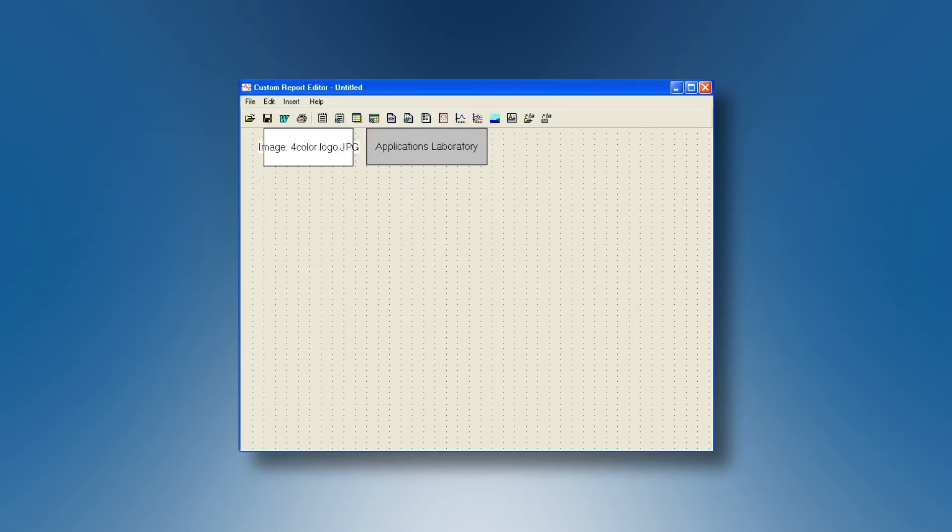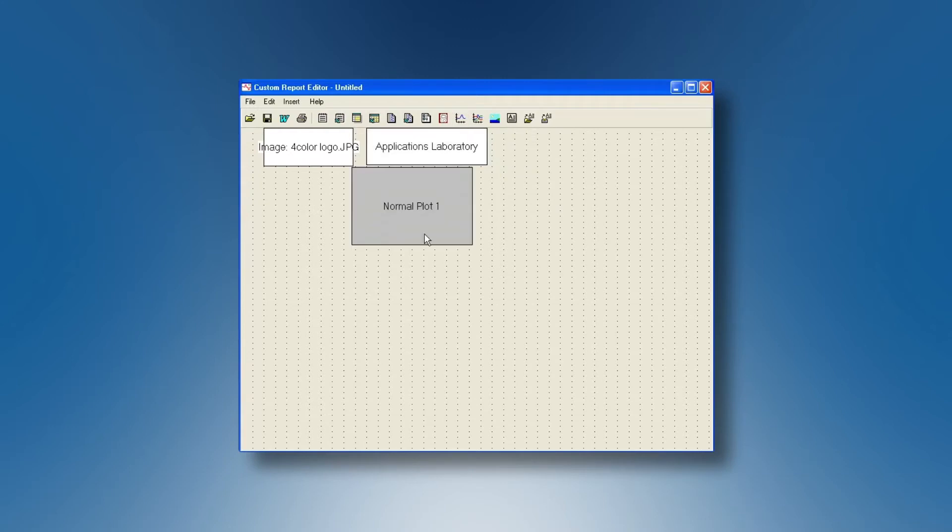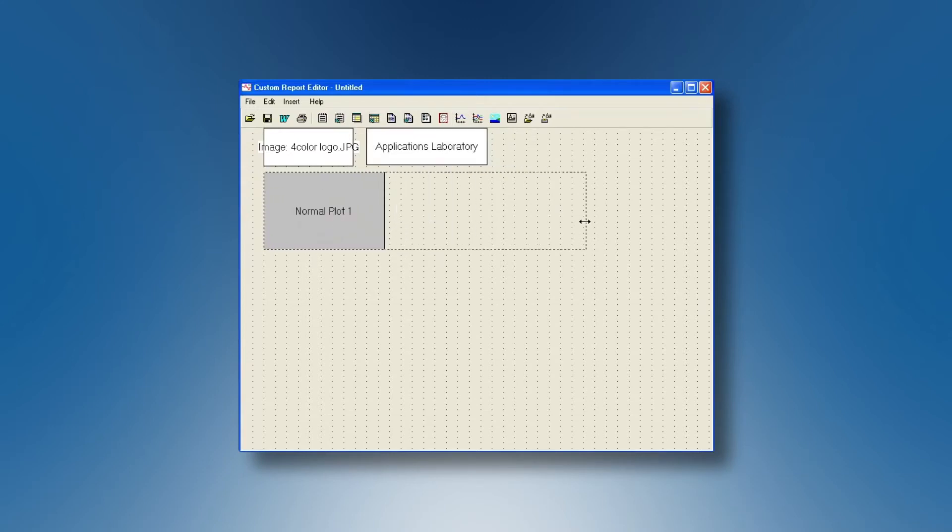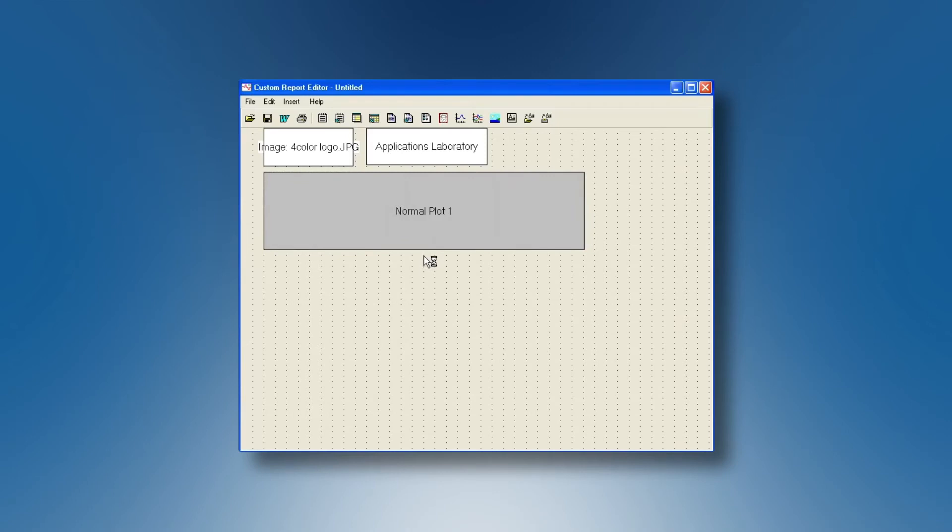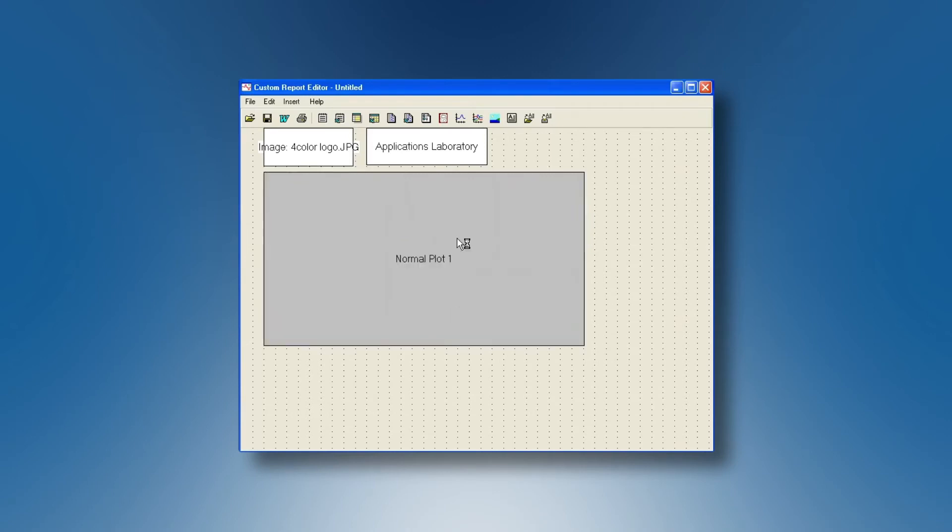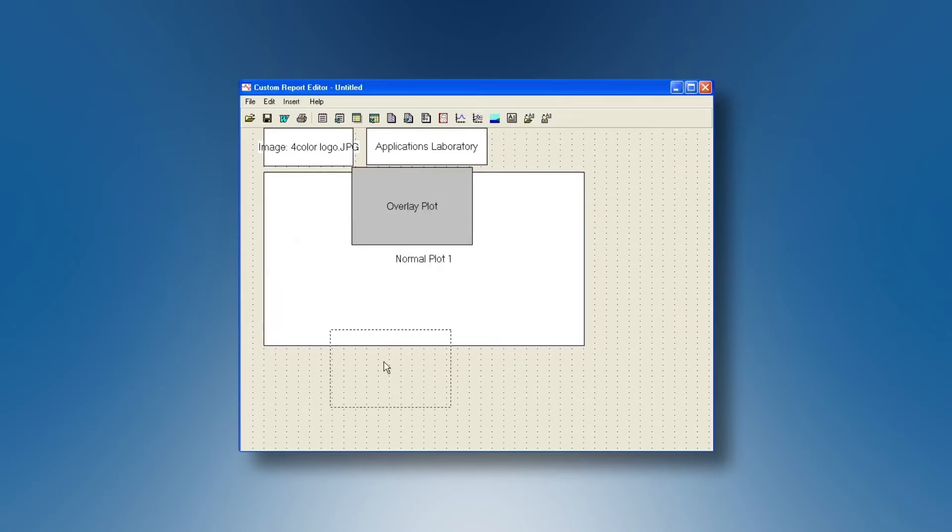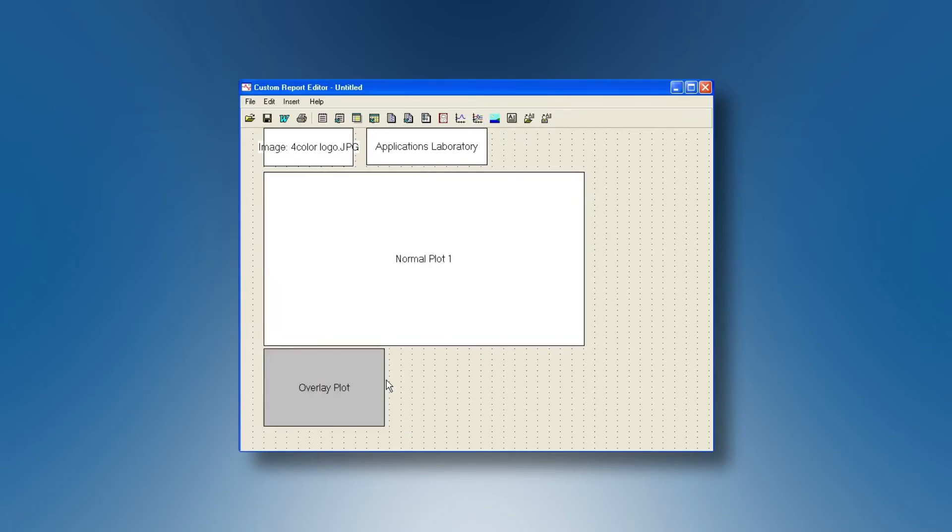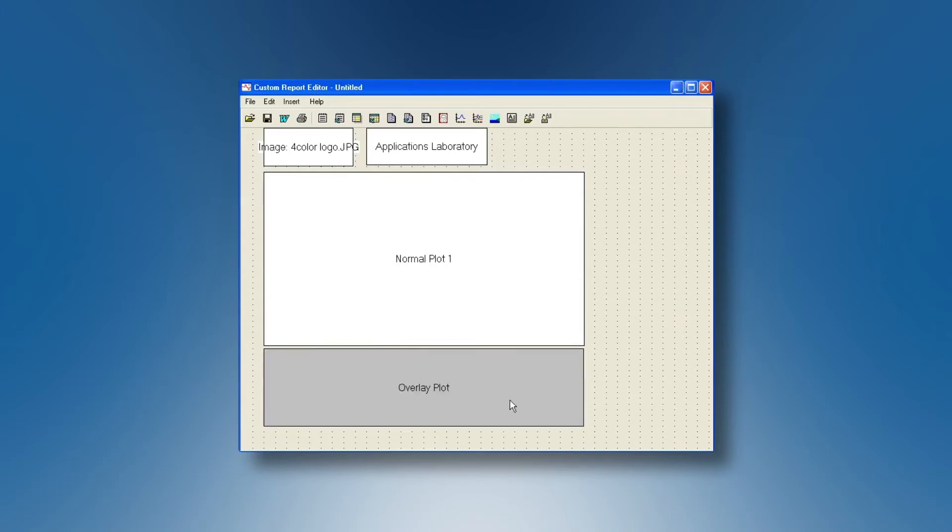Then you can decide for a normal plot and this will be a single data file. So this normal plot will have the size you want on your blank page. You can decide for an overlay plot and if an overlay is available it will come on your blank page in the size you want.